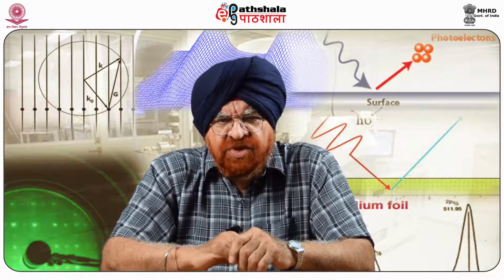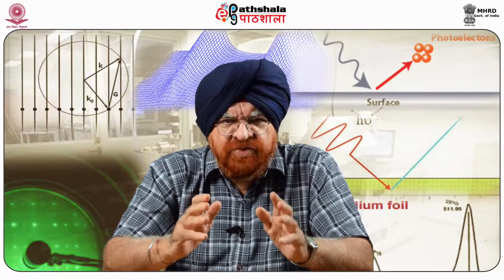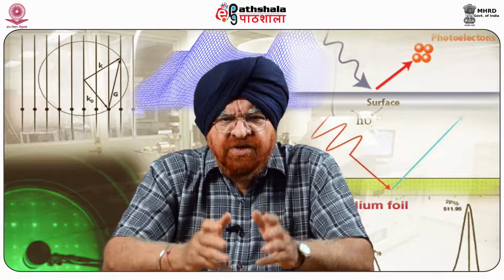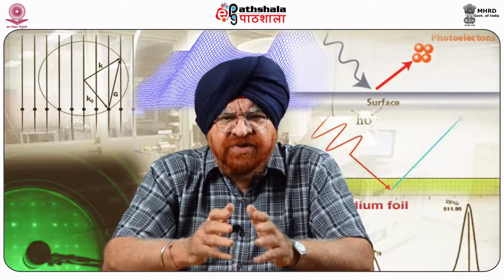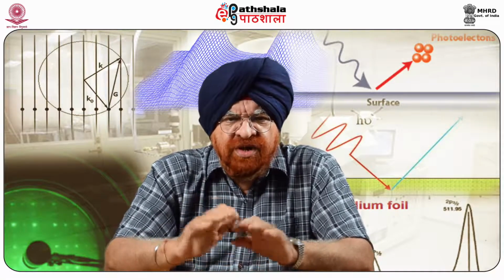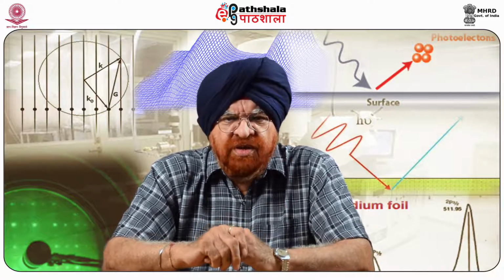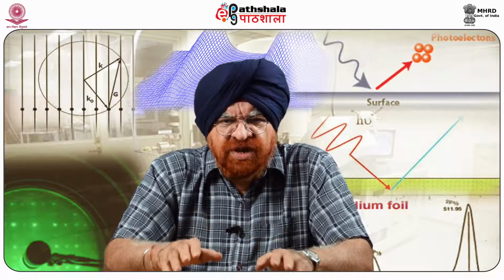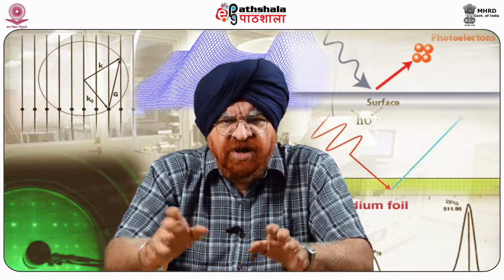Mainly, these ECSTM setups are capable of performing scanning tunneling microscopy or scanning tunneling spectroscopic measurements. The latter are carried out at fixed lateral positions of the tip above the substrate. In current-distance STS, that is, scanning tunneling spectroscopy experiments, the tunneling current is measured at constant ES and ET as a function of the vertical tip displacement, that is, delta Z.